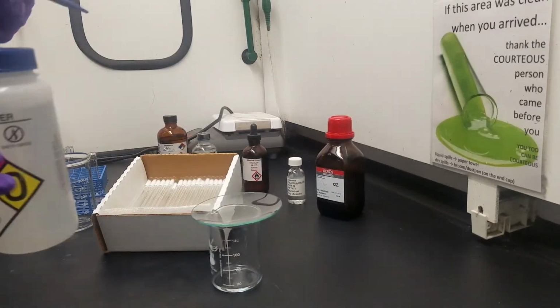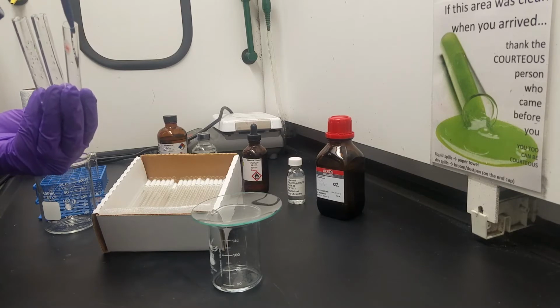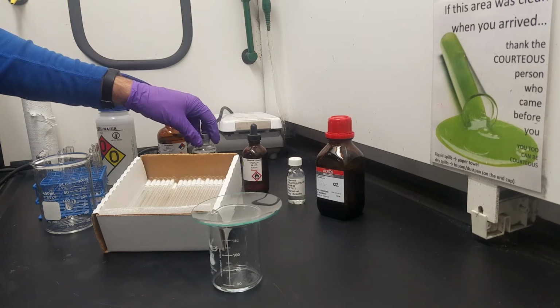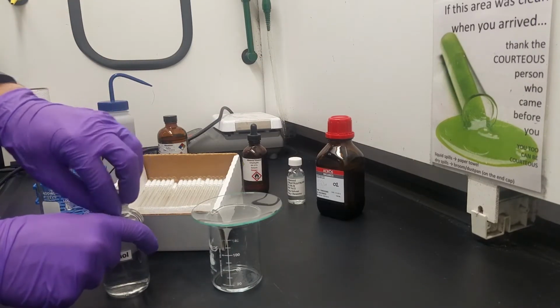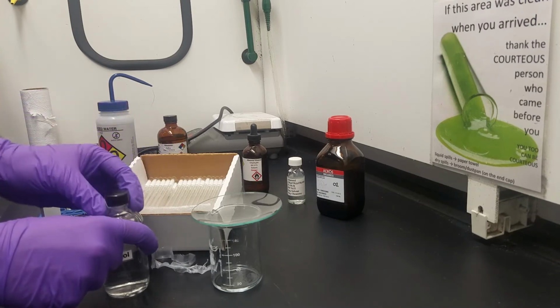So here what we're going to do is prepare our 3 samples with water, because if we can prepare them in bulk, it makes it a little bit easier to deal with. And since water's volatility is relatively low, we don't need to stress about it. The next part is we're going to mix it with a variety of alcohols. The ones we're going to test are going to be methanol, butanol, and octanol. Technically, we already tested ethanol, so you should go back and add that to your list.